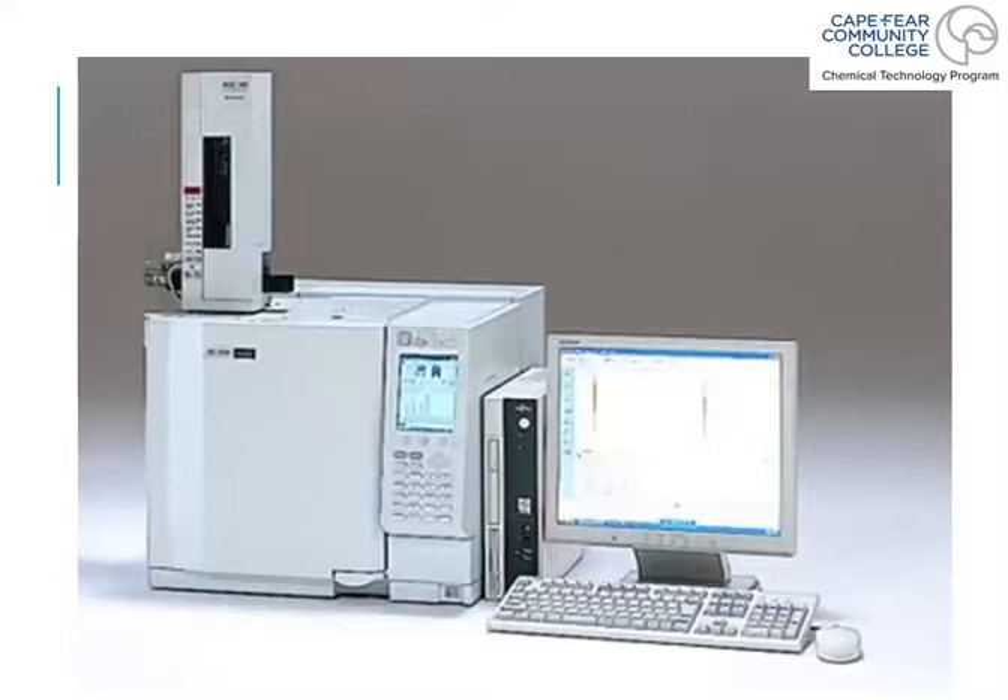You put your sample into a small vial that sits in a tray below, the tray slides back and forth, and the syringe punctures the vial to suck up the sample. It then releases the vial, moves to the injector port, punctures the septum, and squirts the sample into the machine. It loads and injects the proper amount — it's very fluid, reproducible, and precise.